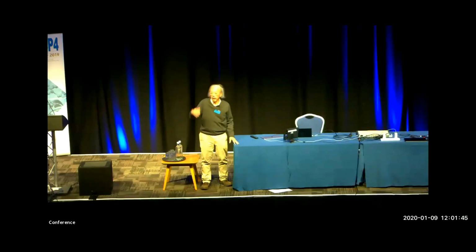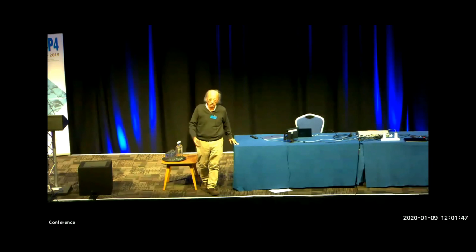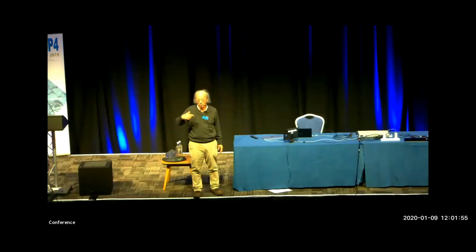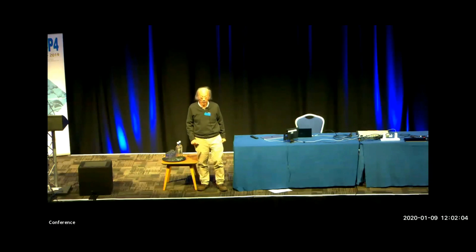But what Gareth suggests is a good one. You need to do more. Beyond apoferritin, we now begin to look more. We're also looking at the damage effect in nucleic acid. There have been suggestions that nucleic acids have different radiation sensitivity because of all these aromatic bases. Metals too, yes.